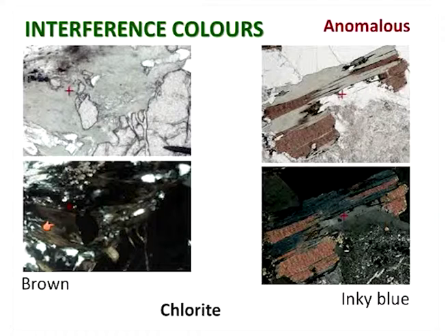Chlorite has a particular birefringence value, but that value does not match the colours that it shows. Now, I don't know why that is, unfortunately. The colours don't fit the chart, Claire says. That's a much better way of putting it. So when you see colours that you can't fit into the neat birefringence colour chart, you just have to call them anomalous.